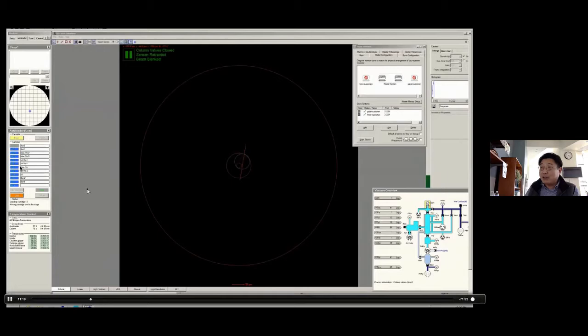So you can see now it's almost finished loading the specimen. From the 11 grids, now we switch to 12. And this is in total about 5 minutes. After this one, you will see how we are able to collect a montage and then collect the image, using different magnifications to control Cryo-EM to select the area of interest.